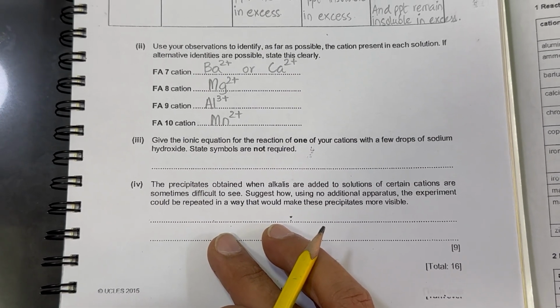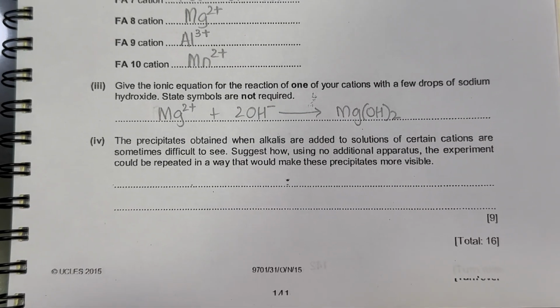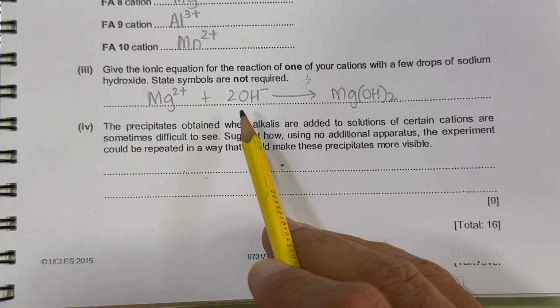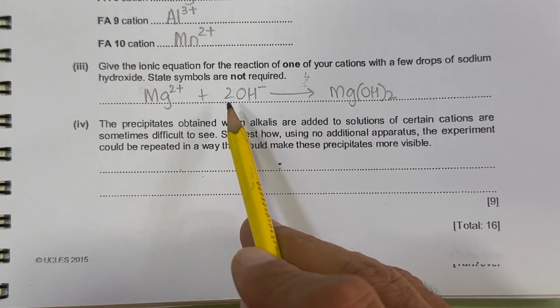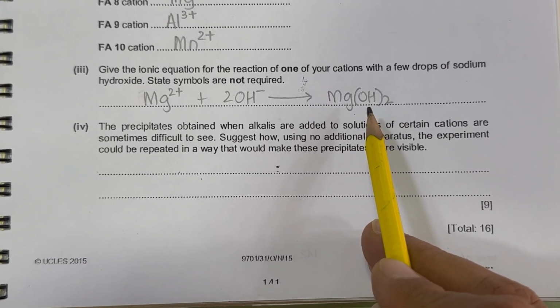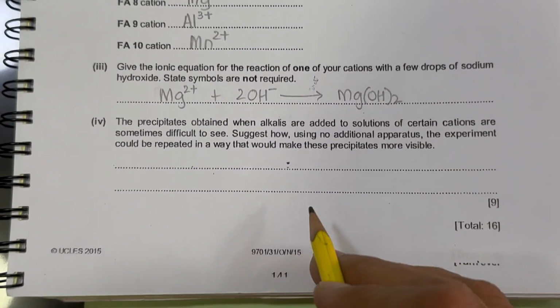Let's move on to the next part where it says, give an ionic equation for the reaction of one of the cations with sodium hydroxide. So whenever we write the ionic equation with sodium hydroxide, we write it this way: magnesium 2 plus with hydroxide. For any metal, whatever its charge is, we add that many hydroxide ions and we form precipitates of its hydroxide. So here we have magnesium hydroxide formed as a precipitate. In this case you can see the insoluble precipitate in Fa8, right? So we write the ionic equation this way.